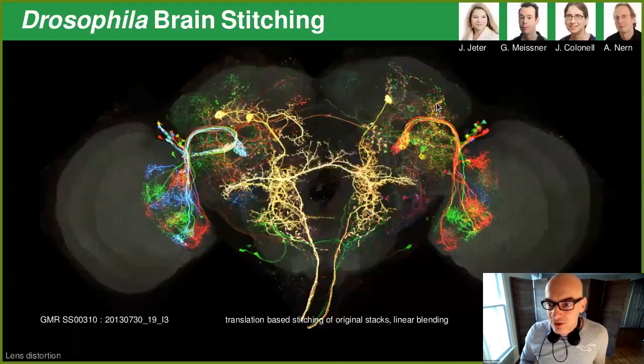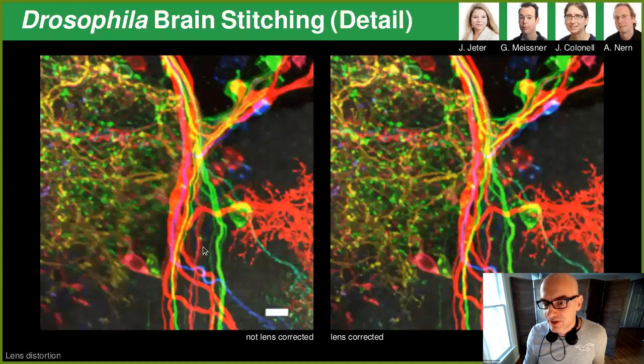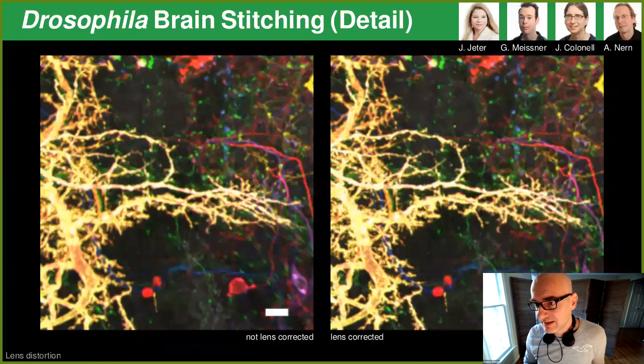Okay, so practically, when we switch before and after, this is probably not something you can see over a Zoom presentation, and you also don't see which one is better when we zoom out so much, but it's much more clear when we zoom in. So here on this side, we see the stitching we saw before lens correction, and on the right side, we see it after, and I can switch between the two things. We can appreciate the difference. And since we're using an averaging blending, it is very clear that post-lens correction things get a little bit nicer. And the same thing is true here.